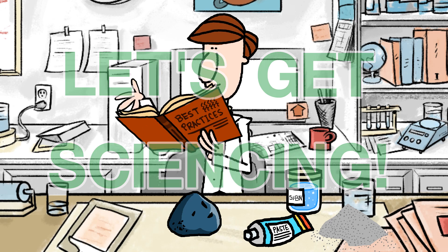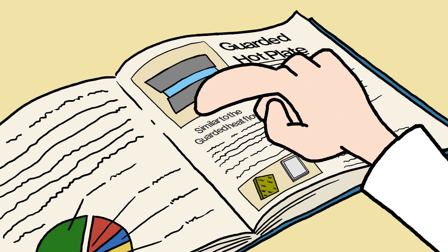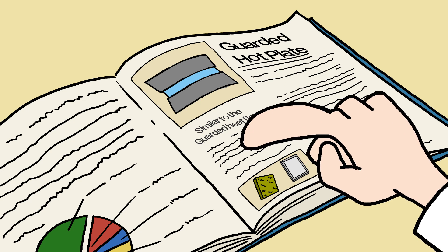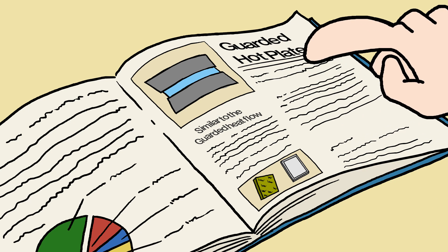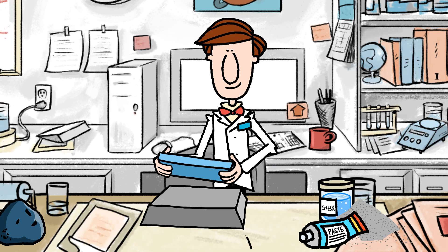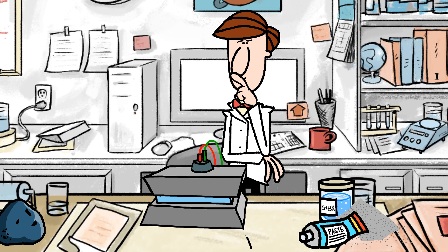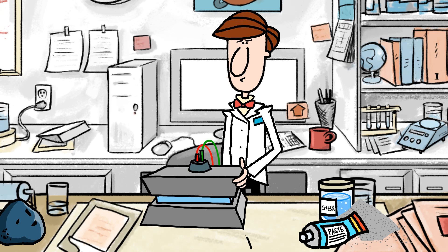Let's get sciencing. The oldest method of thermal conductivity measurement is also one of the most trusted. It's called the guarded hot plate. As Mr. Scientist demonstrates, a solid sample must be machined carefully.